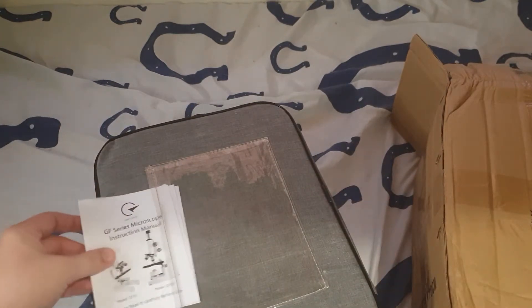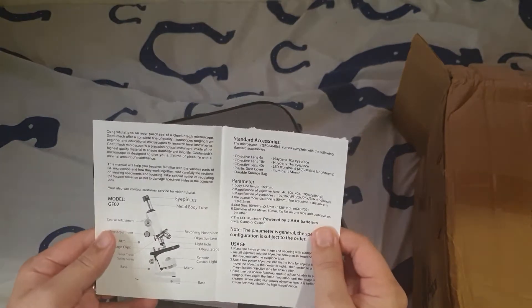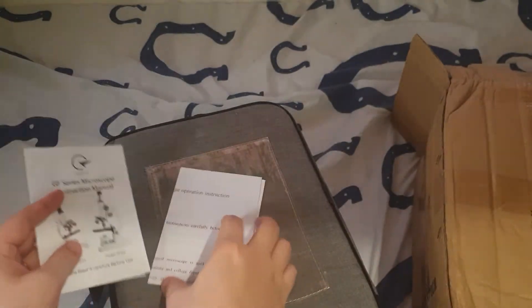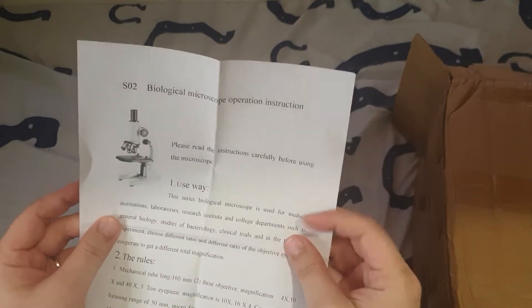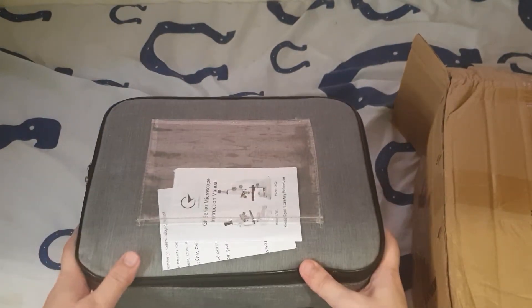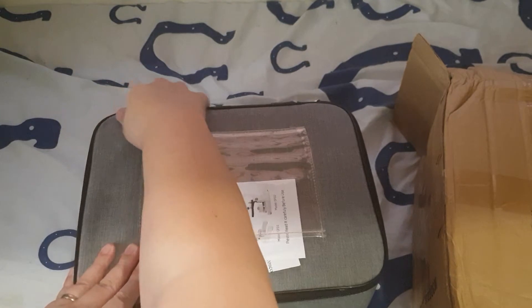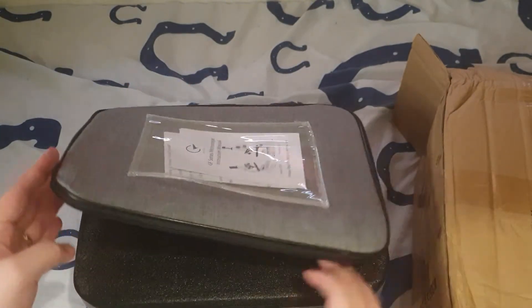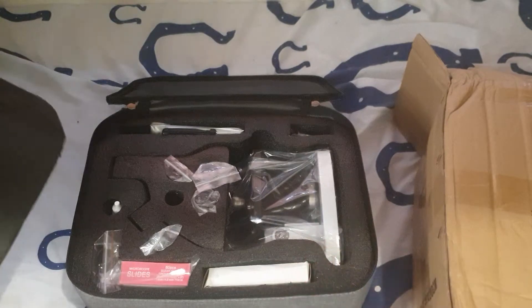So, GF series microscope, instruction manual. I'm opening this for the first time, so you're experiencing this with me. I am quite familiar with how to use a microscope from school. By the way, this is a premium package — there are various pricing tiers, and not all of them come with a box. I did buy the premium package with the box container.